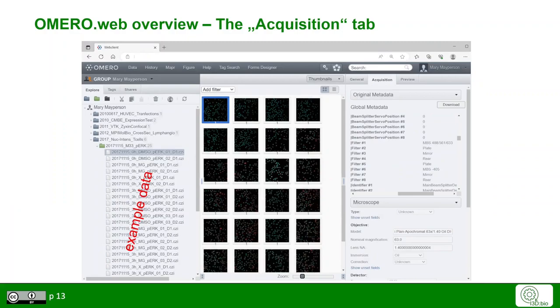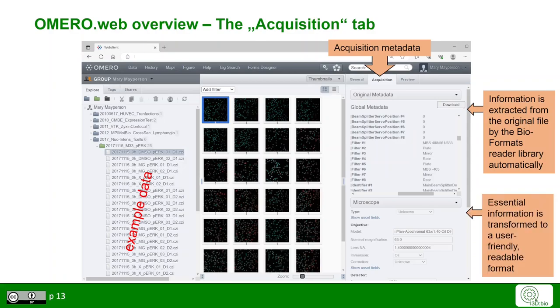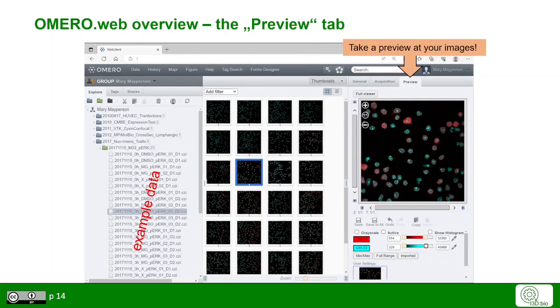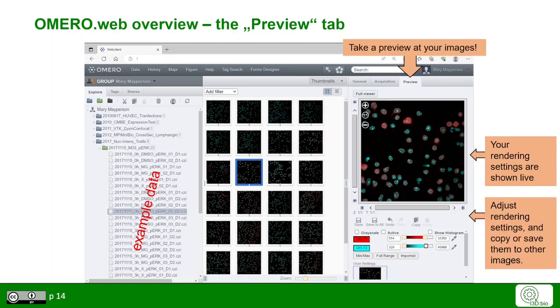Let's have a closer look at the tabs. The acquisition tab shows you the acquisition metadata from the session of when the image was recorded. This information is extracted from the original file format using the bioformats reader library in the backend. This happens automatically. Some essential information about the image is transformed to a very user-friendly and readable format. In the preview tab, you can have a closer look at your images. Your current rendering settings are shown in live to you and you can adjust the rendering settings and copy or save them also to other images.